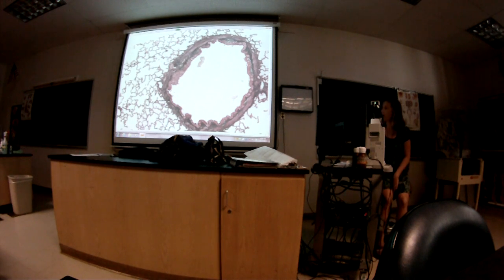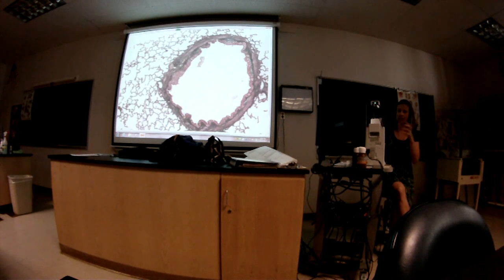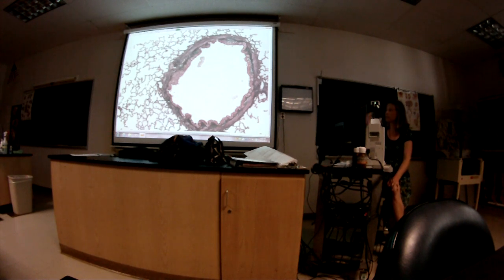Yeah, this is the smallest passageways that the alveoli are going to start sprouting off. The bronchus and bronchi are much bigger structures. It goes trachea to primary bronchi, secondary bronchi, and tertiary bronchi, and then the bronchi do get smaller, but they're still a lot bigger than these. This is a bronchiole. Now, how did you know it's a bronchiole though?